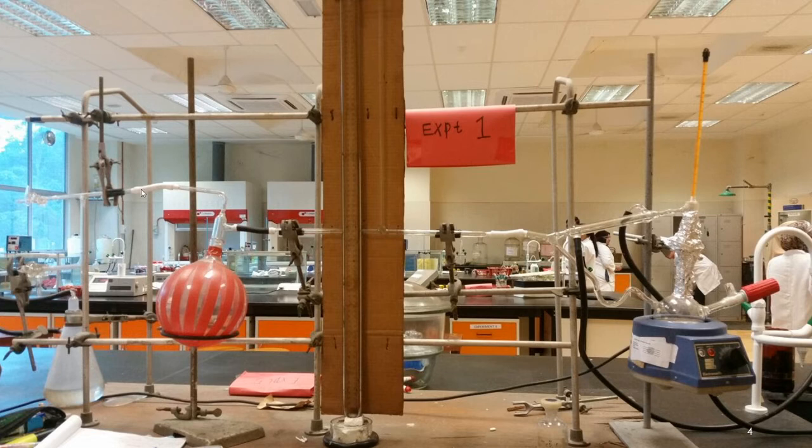Now that you have gotten one value, you need to get a second set of values. To do that, you need to increase the pressure.